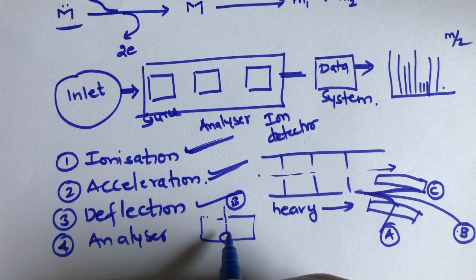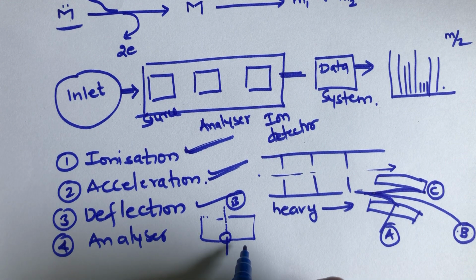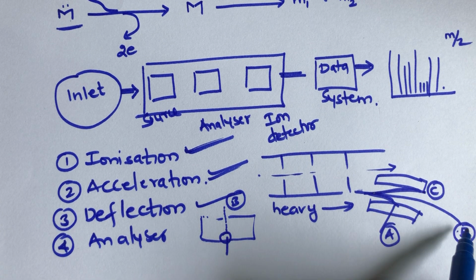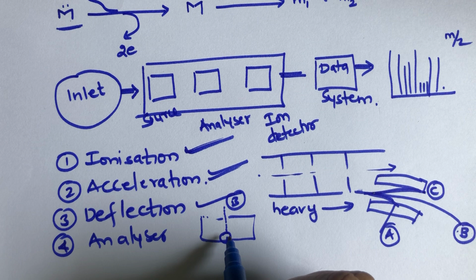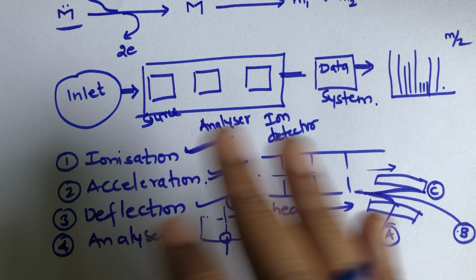When it reaches the detector and hits the wire, the ions become neutralized by an electron jump. They take up an electron and become neutralized. The amplifier picks up the current being created between the wire and the ion and amplifies the signal being detected.